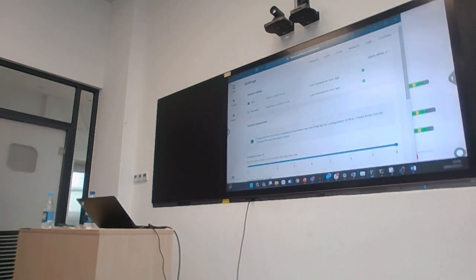Okay. Let's check. So it's messages, yes. So can we go to... Yeah, the old Windows version.